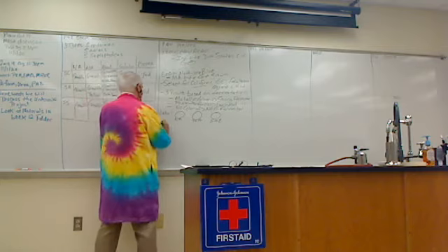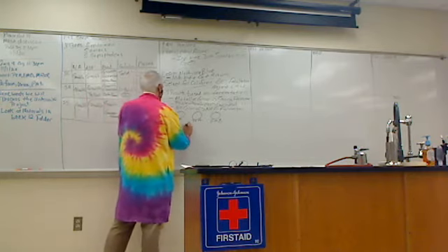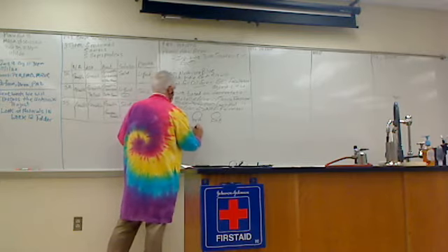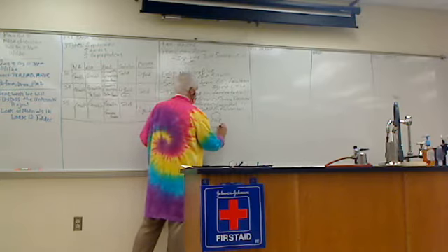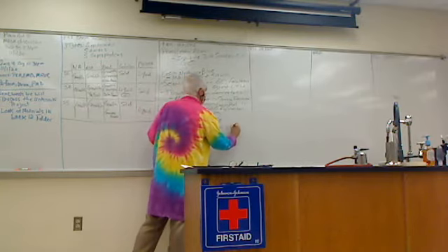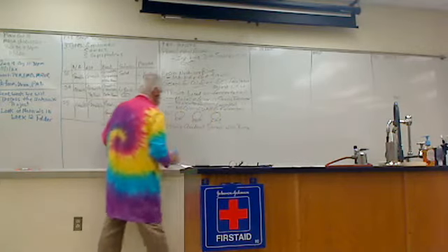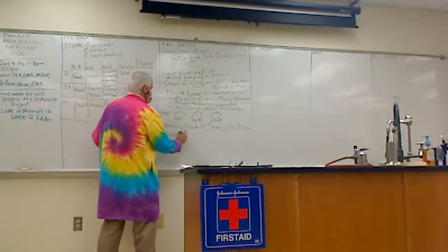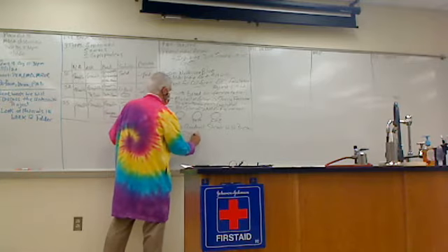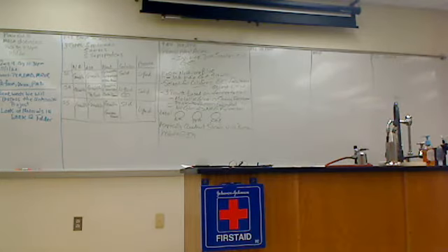Then you're going to aseptically quadrant streak with your bacteria. And then incubate at 37 degrees C. So, quadrant streak means how many directions? 4 directions, right?